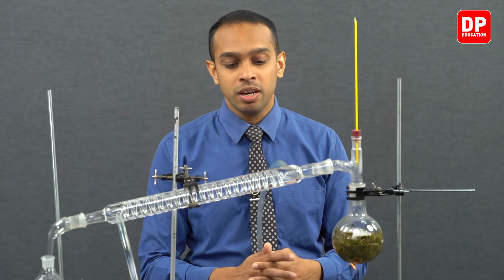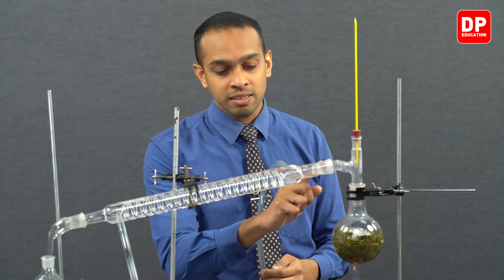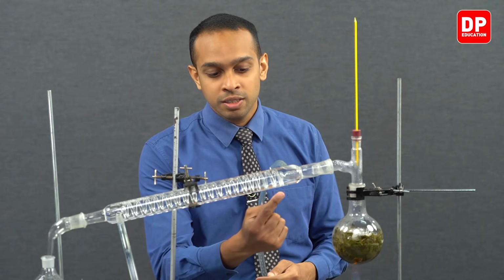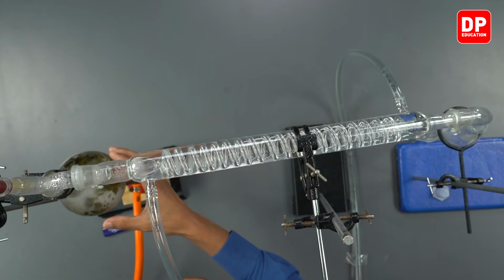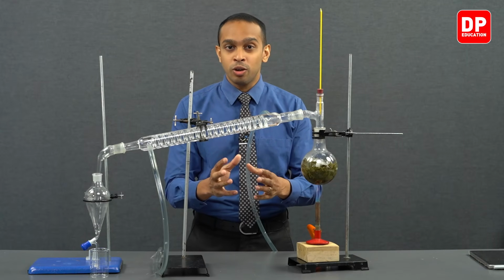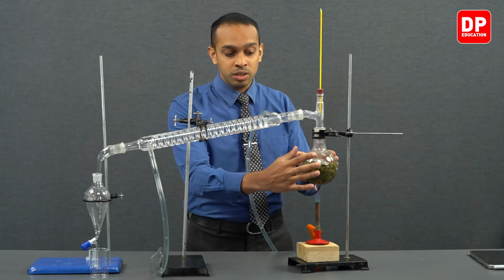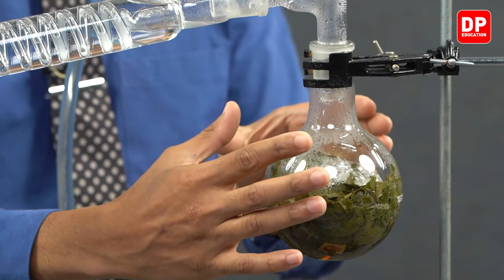And if you observe here, students, you can see the gas that is getting collected over here is now condensing into a liquid. Observe here, you can see the vapor mixture that is produced, which is a mixture of the essential oil and water.